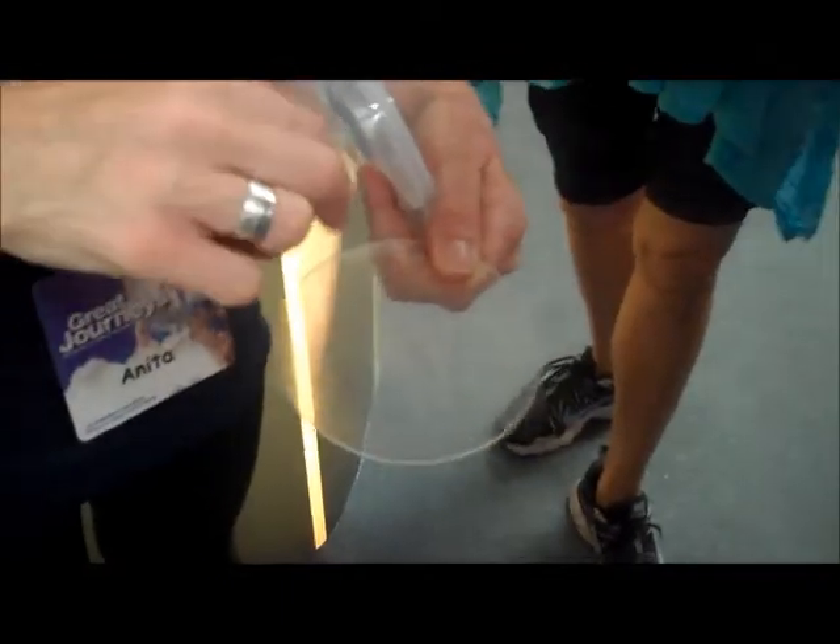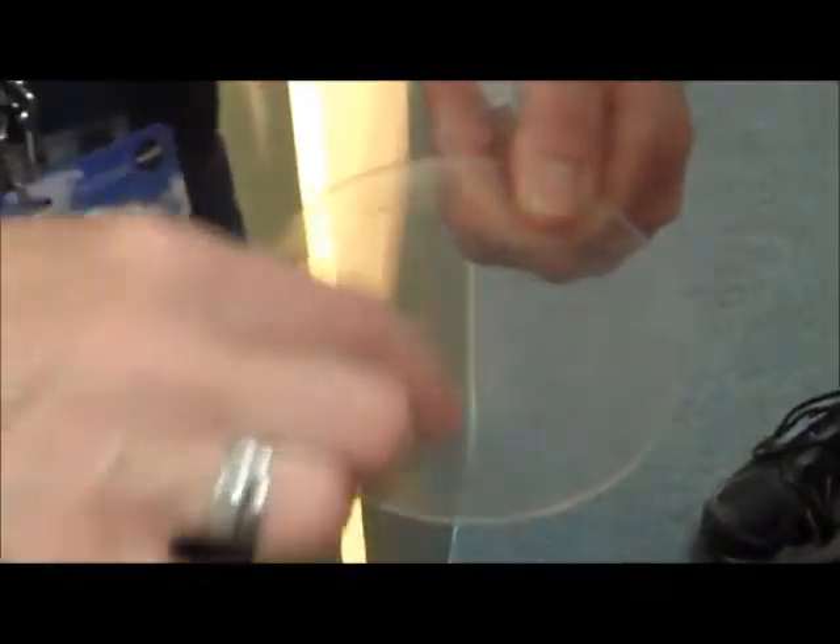These are little holes drilled into the top glass, and the sample actually gets injected into there. And as we apply the electric current, it flows along — it just gets pulled along. And the amino acids are floating in there too, and they get pulled along, and they come out at different times because they have different charge and size.